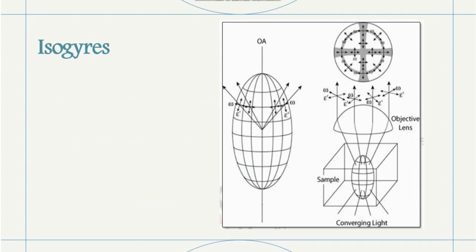So what happens is, remember the light will be coming from the source and going up. Then approximately at the center of this indicatrix, which for this one is the uniaxial indicatrix, the light comes from the center.